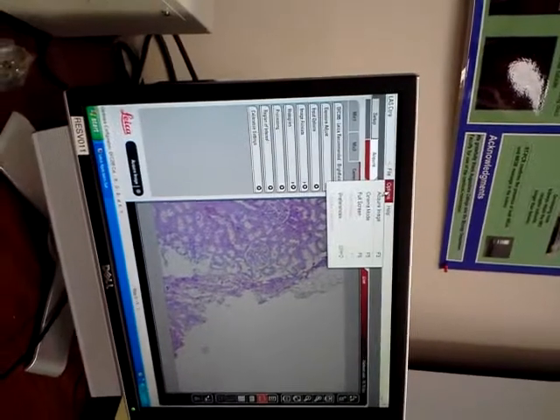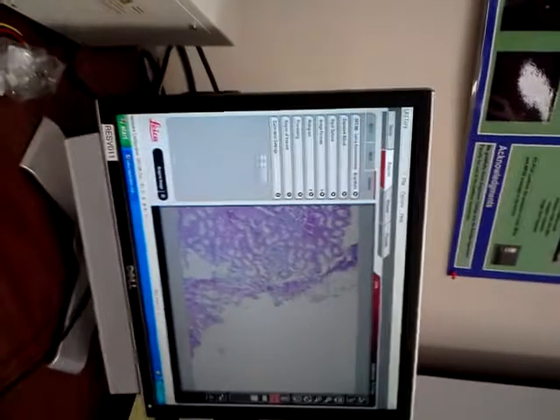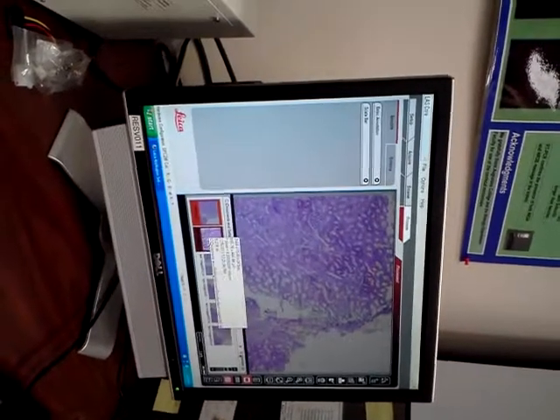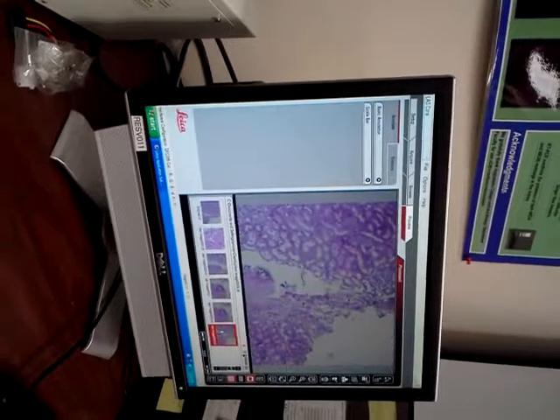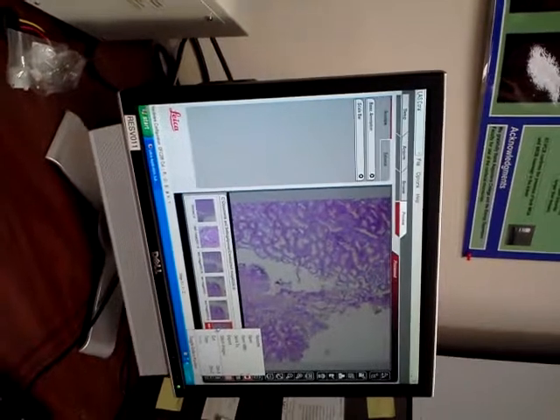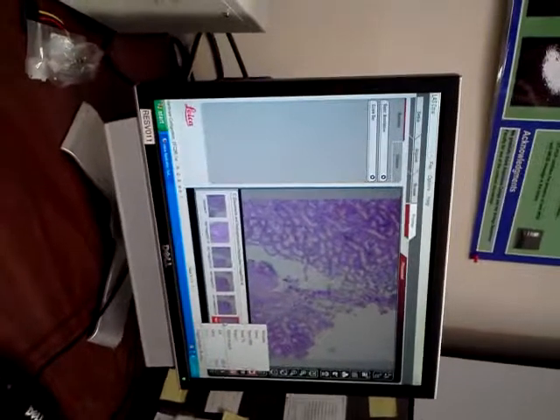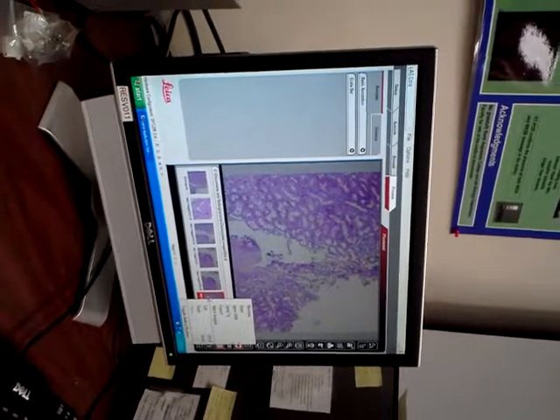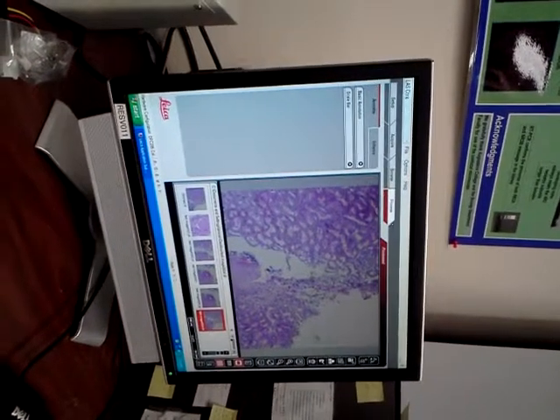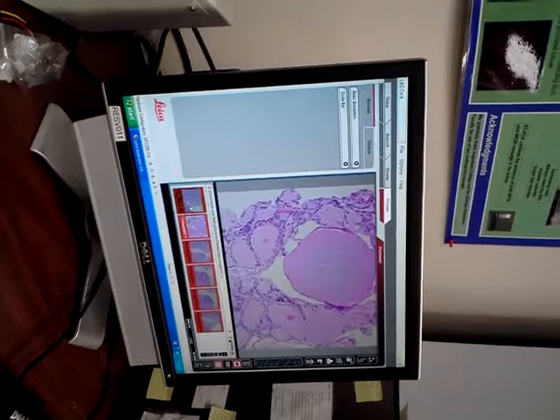And for exporting, where it processes, right click on these images. What if I want to save a whole batch that I captured today? I want to take them off to my office and work on them. You still have to do it there. You can't do it in Windows, even for exporting. You can do that in exporting.